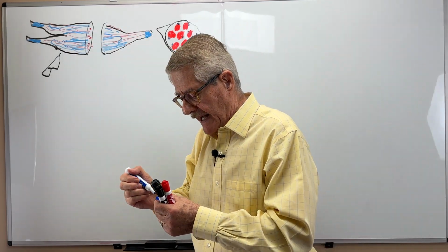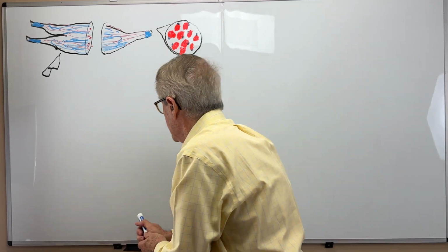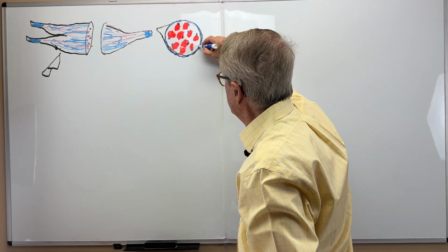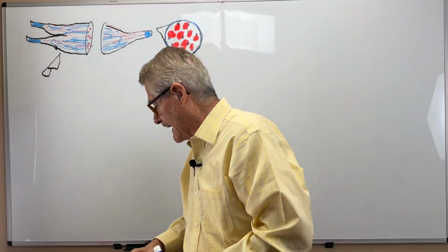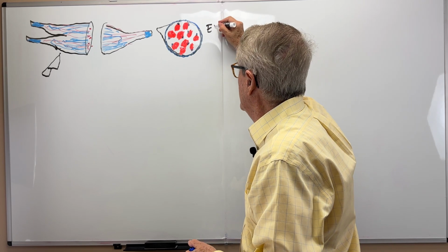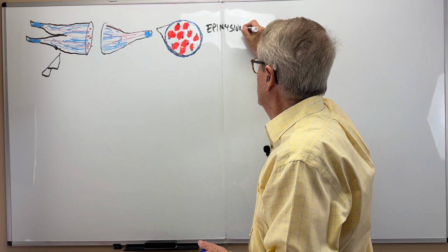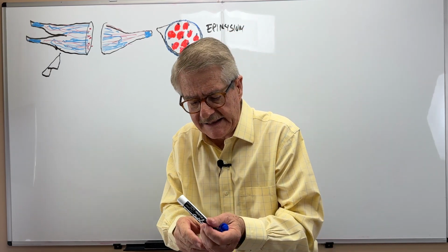Now, we said that the muscle is covered by a layer of connective tissue, and we can actually make it evident that this is the layer of connective tissue. It's like a sheet of connective tissue that is going to be called epimysium. And it doesn't end like that.